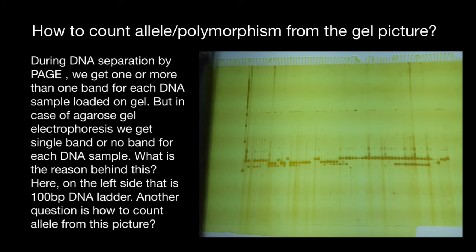On the other hand, polyacrylamide gel is a synthetic polymer, which is used to create the gel matrix in PAGE. Polyacrylamide gels have smaller pore sizes and are suitable for separating smaller nucleic acids such as PCR products, oligonucleotides, and proteins.